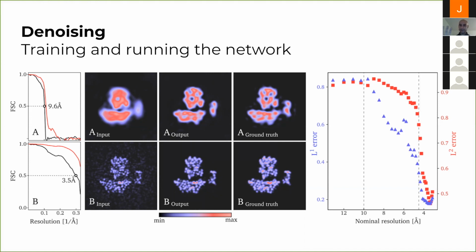So this is a single run. If you run the denoiser a single time without doing an iterative reconstruction, this is just running the denoiser once with the input and comparing that to the ground truth.